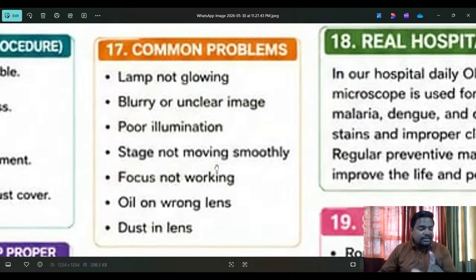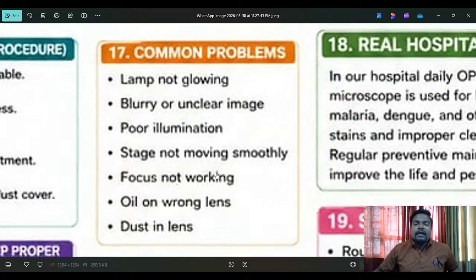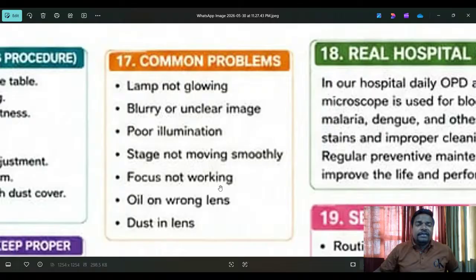First of all, let me explain all the things I brought for you, because for very interested people every piece of information is very important. I'm trying to give you the explanation very clearly. Now let me explain and read out, and finish very quickly, in a very understandable way. And the common problem, see here.